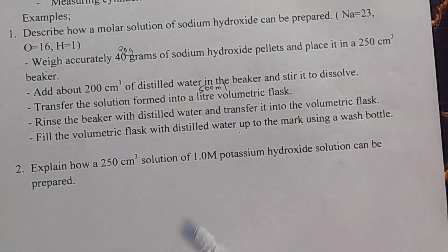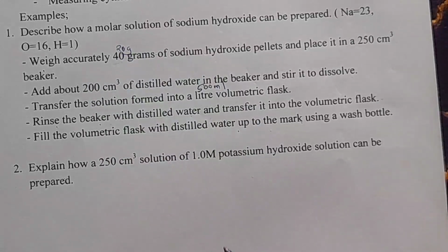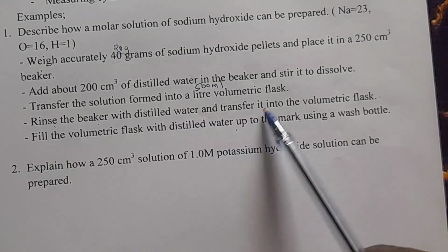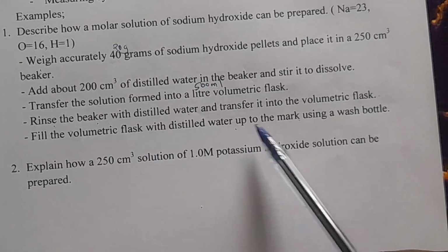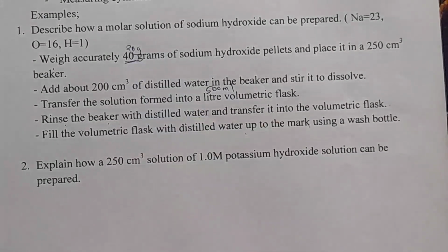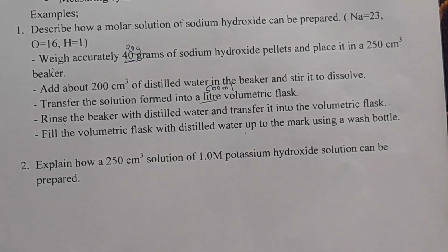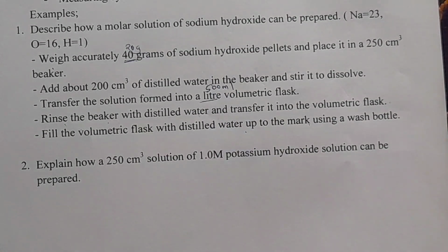If you want to change the mass to 20 grams of sodium hydroxide instead of 40, you rinse the beaker with distilled water and transfer it into the volumetric flask. Then you fill the volumetric flask with distilled water up to the mark using a wash bottle. So only the change will be on that side: 40 grams, you make it 20, and also the volume, or the measurement of that volumetric flask, is supposed to be 500 ml instead of a 1 liter volumetric flask.